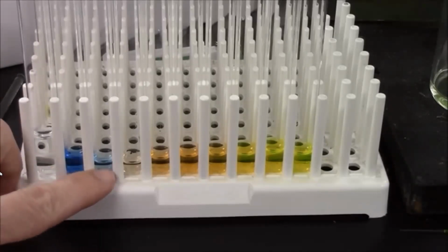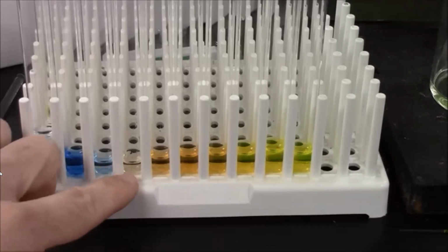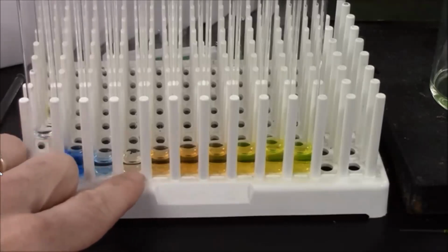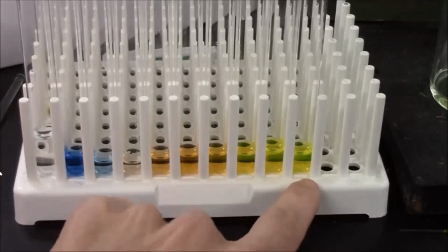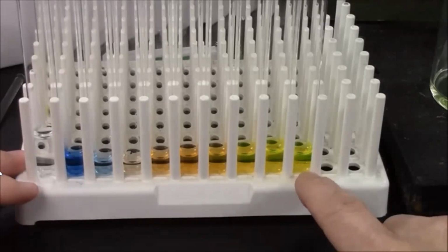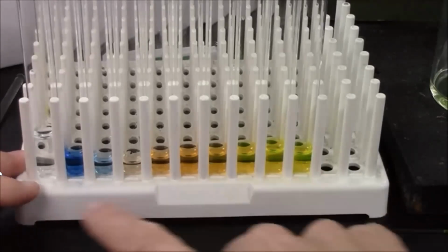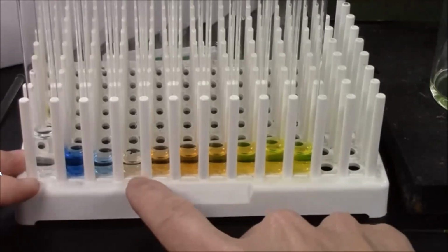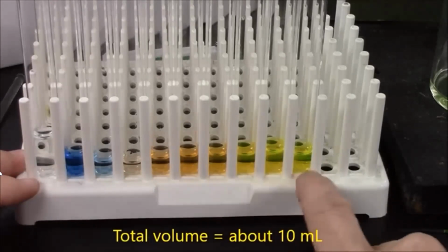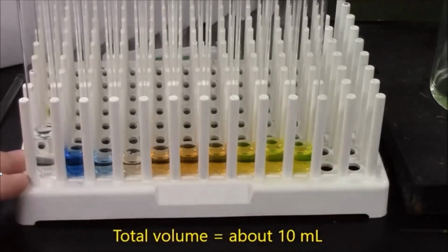Some of the blue dextran tailed into the next fraction. This is low concentration. Then I have a nearly colorless fraction here, and then the fluorescein starts coming out here. Fluorescein stopped coming out right about here. So the total volume will be 2.5, 3.5, 4.5, 5, 6, 7, 8, 9, about 10 milliliters is the total volume, which is what I would expect for a column of this size.